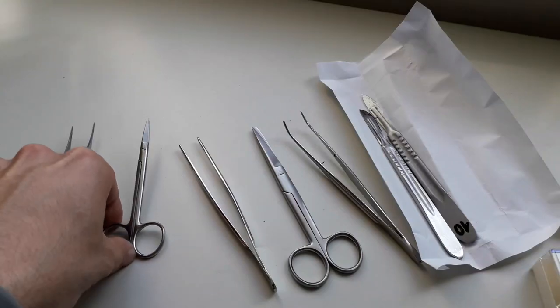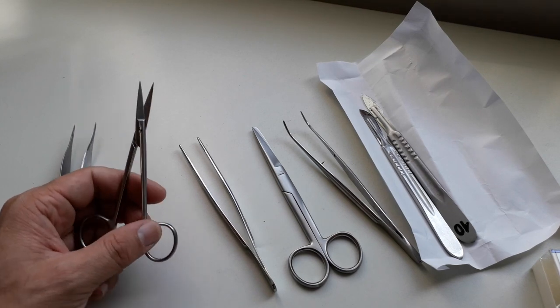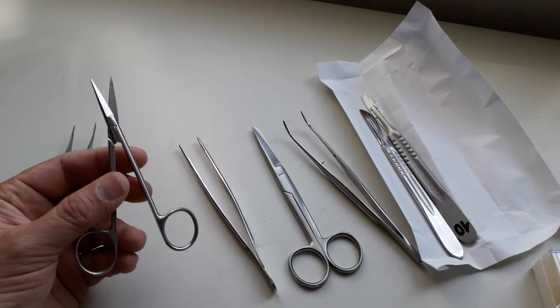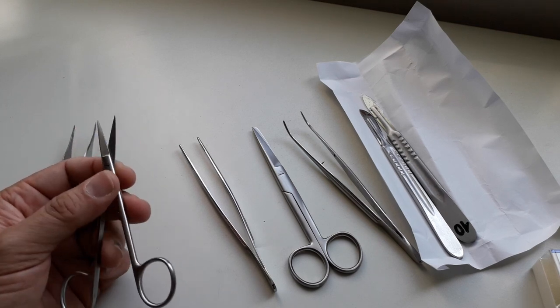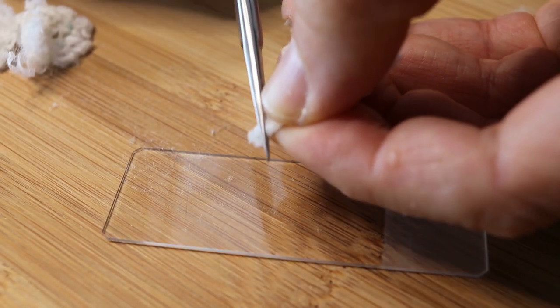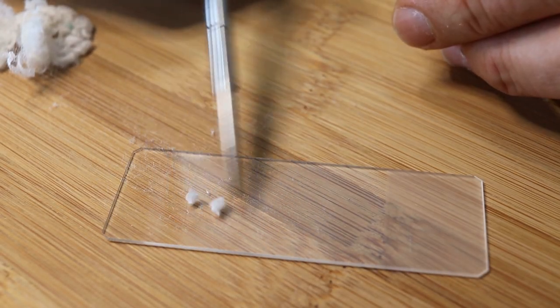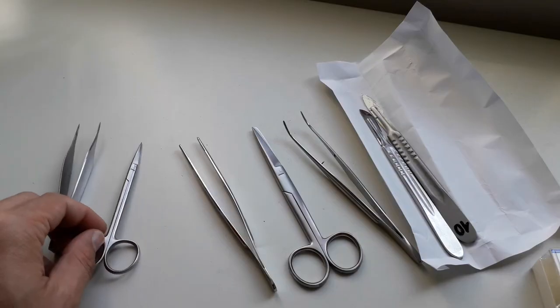Then those scissors here, those dissecting scissors, are probably the second most commonly used tool that I have. They're good for cutting apart small specimens, and even when collecting algae, which are very fibrous and long, I can cut through them as well. So that is also very, very useful.